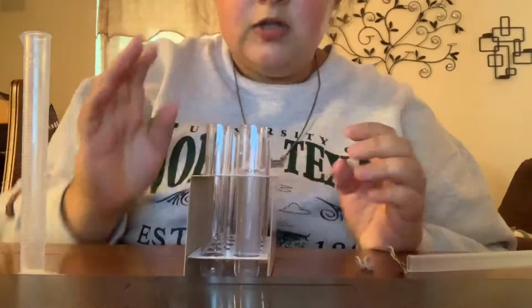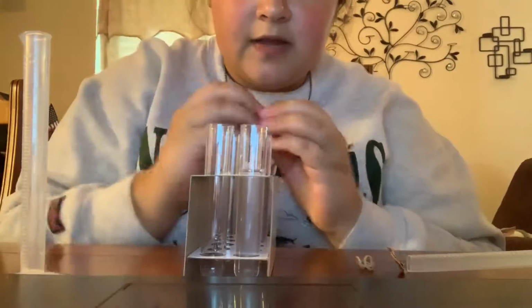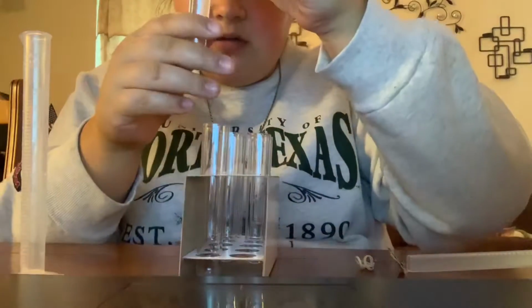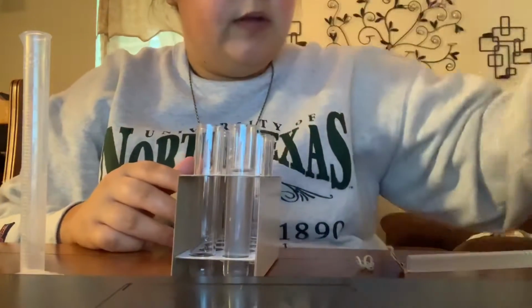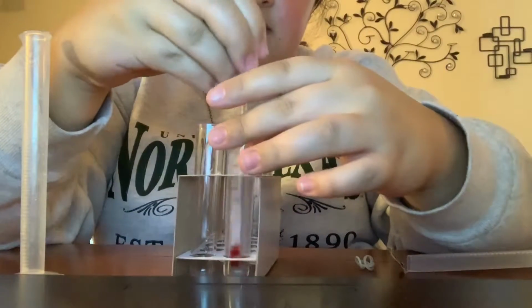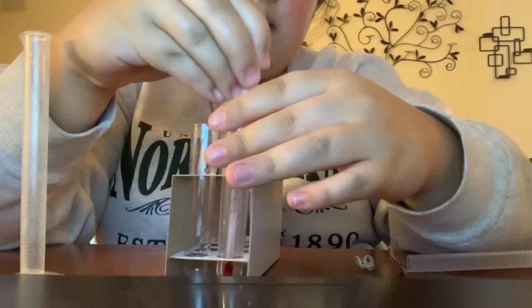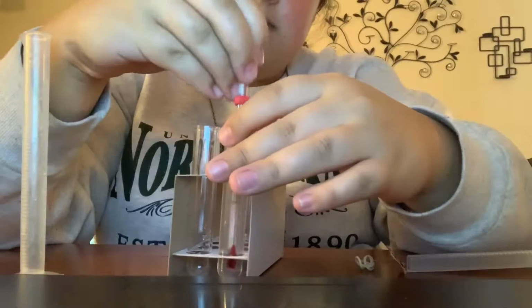Oh, my first impression, I can see how the powder kind of came up through the water and then just poof, and it's a gel. It's a gel. So I am going to insert my thermometer to give it a mix, but oh yeah, it's thick. Not as thick as a bath gel, but thicker than pancake syrup.